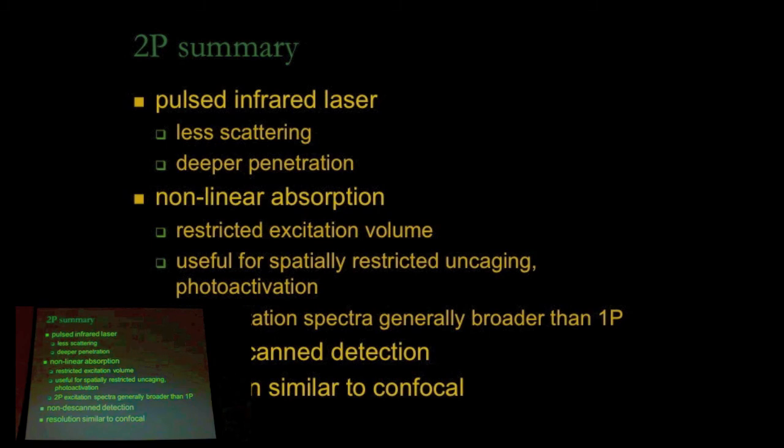For live imaging applications, I've heard that light is harmful to cells in general, so too much radiation is bad. Does 2-photon with a longer wavelength mean that you can image with less phototoxicity? Probably the biggest advantage is that you're not illuminating so much above and below the focal plane. You're limiting it right to the focal point of the objective, but you can still crank up the laser.